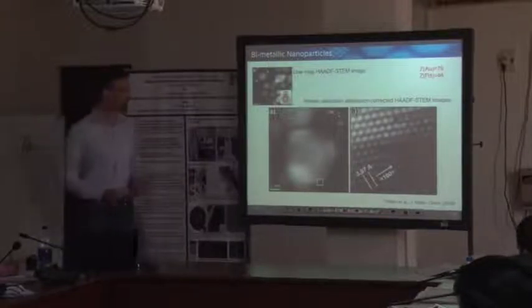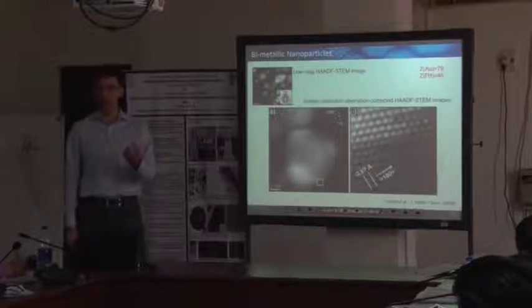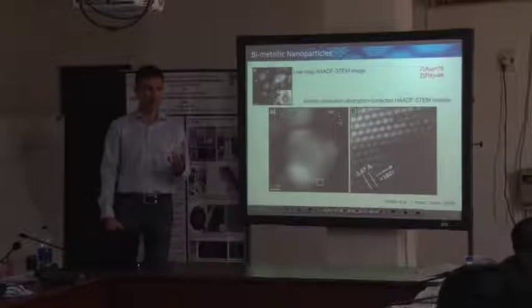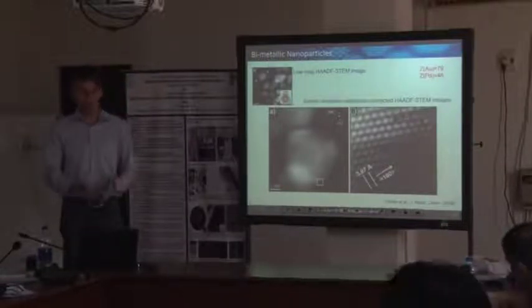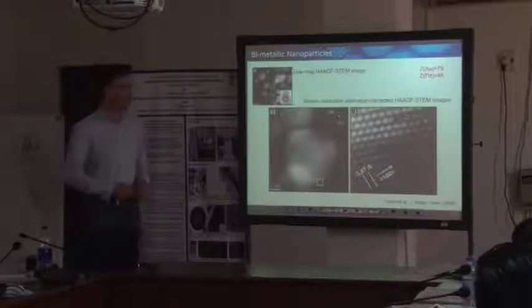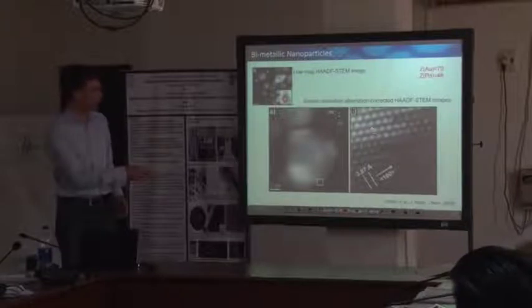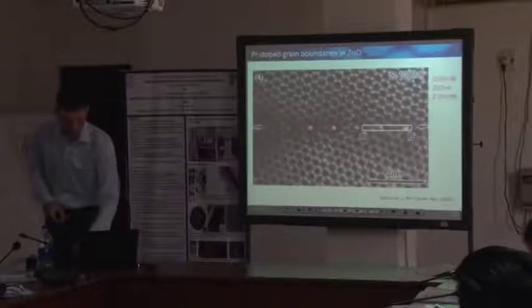People came up with the idea to use the local intensity because we know the scattering impact, the atomic form factor, on our electron beam. We know in principle our beam current, which we can measure in the microscope. And people want to do quantitative analysis and derive local compositions by determining the local intensity and comparing that to a simulation.